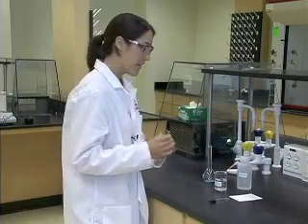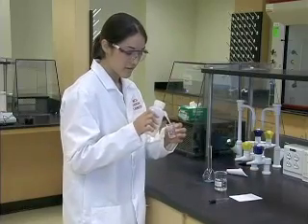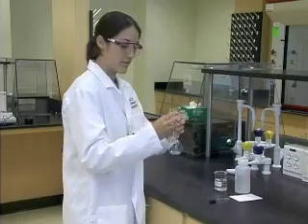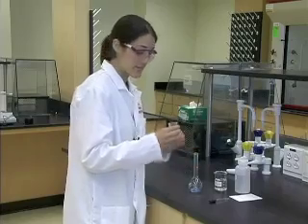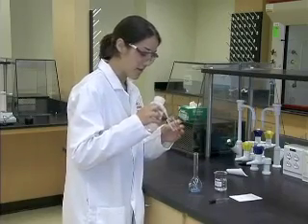Now you may notice that there is some solid left in our beaker. We will then add some deionized water to the beaker and rinse the rest of the solid into our volumetric flask. You may need to do this several times, so please do it as much as necessary to remove all of the solid.